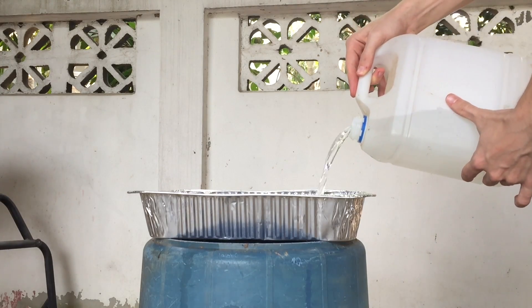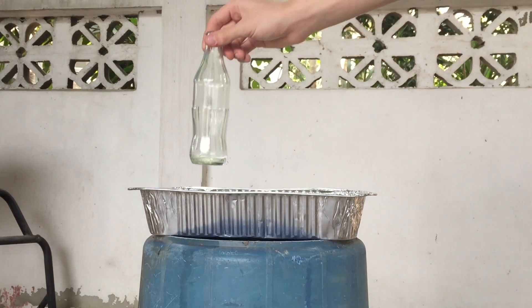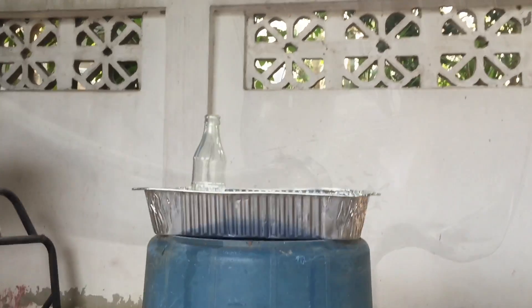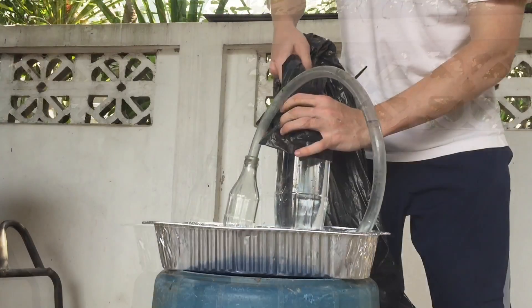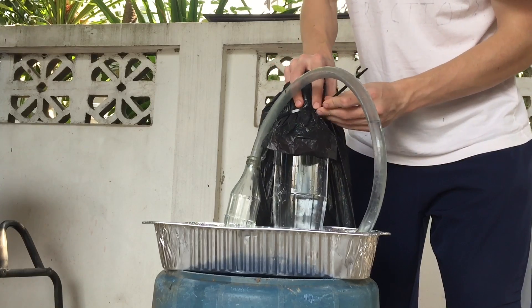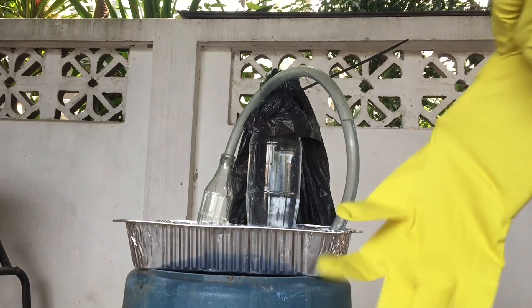My setup is pretty similar except I'll be using a different reaction vessel, and I'm also using a heat sink because I'm not sure how the bottle is going to react to all the heat given off by this reaction. The bubbler is a half-inch vinyl tubing epoxied into a soda bottle, and I was trying to fill a trash bag zip-tied to it, but as you'll see it didn't really work out.